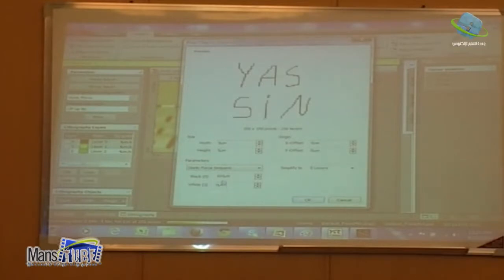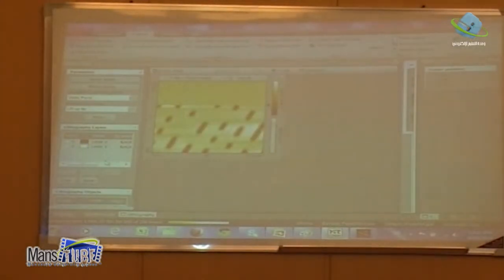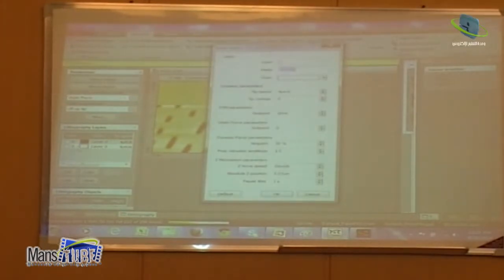I mean, I will change it. We put, let's say, 1 micronewton, and in white he applies 0. If I here choose, let's say, 256 layers, okay? What's happened now? There are just 2 layers here. This is maybe too much, so maybe you can make 4 layers, okay? If I click on it, you see there are 3 layers actually with 0, because actually I have just 2 layers.